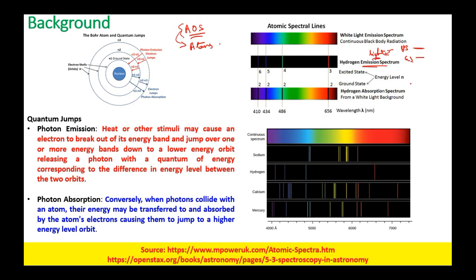On the contrary, when we talk about the absorption spectrum, herein the electrons within the atom gain some energy from the white light which is made incident onto the atoms, and they go to the high energy state and absorb the light, and due to that we obtain a dark band.